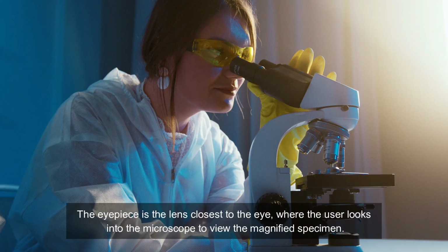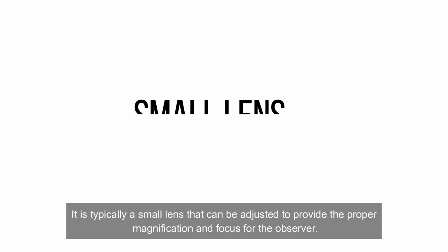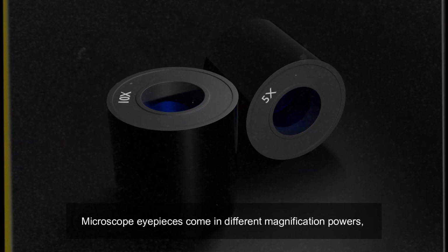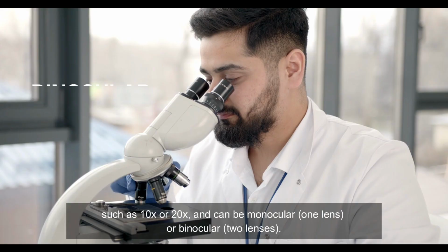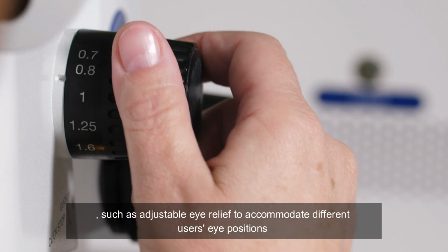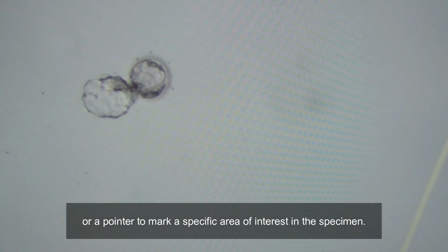Eyepiece. The eyepiece is the lens closest to the eye, where the user looks into the microscope to view the magnified specimen. It is typically a small lens that can be adjusted to provide the proper magnification and focus for the observer. Microscope eyepieces come in different magnification powers, such as 10x or 20x, and can be monocular, one lens, or binocular, two lenses. They may also have additional features, such as adjustable eye relief to accommodate different users' eye positions, or a pointer to mark a specific area of interest in the specimen.